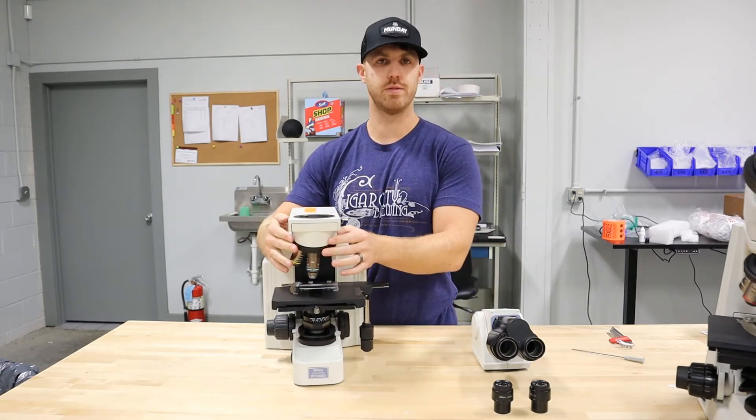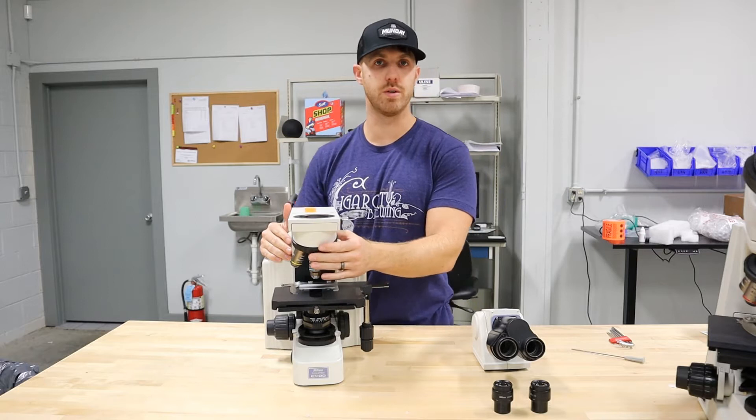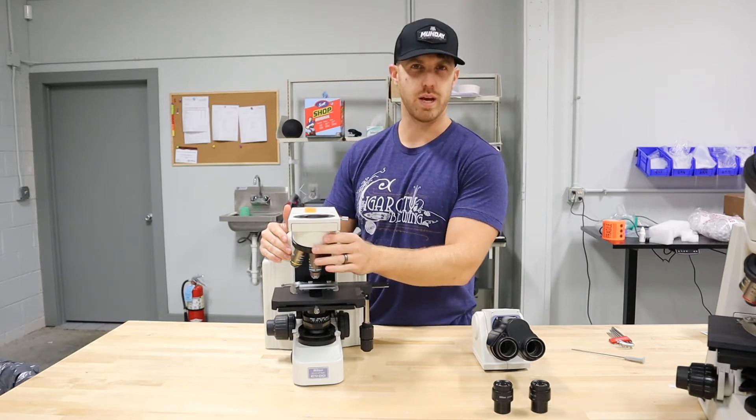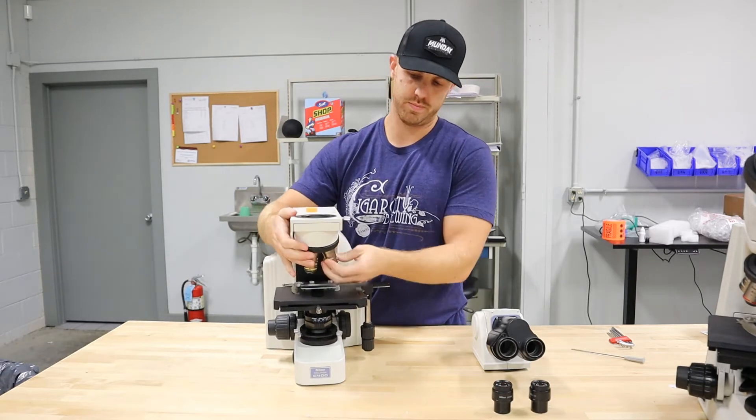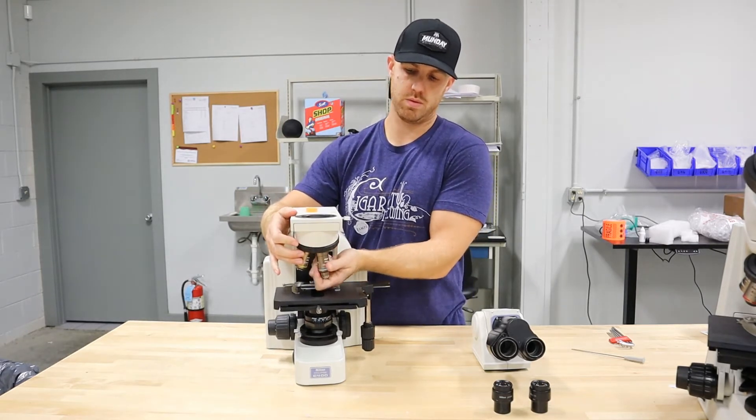This nosepiece is fixed — it does not come off like some of the other Nikon models, so you don't really have to worry about that. The objectives screw off on a regular thread.